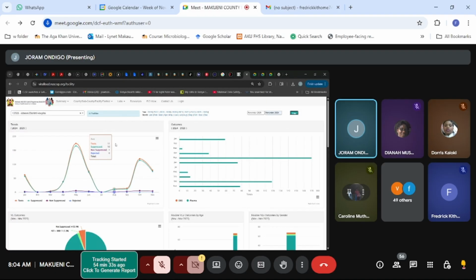Very, very important that everybody understands. This one, you don't have to have any credentials. As I told you, you just go to the EID VL system, and then you go to this website, and then you are able to access all the data you need.